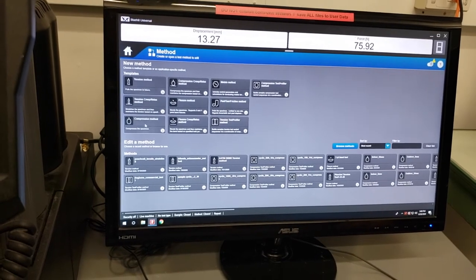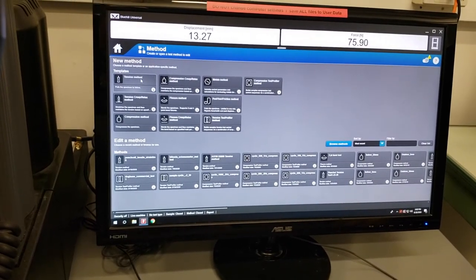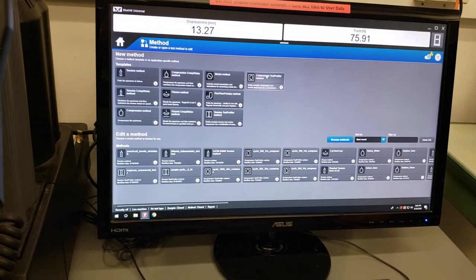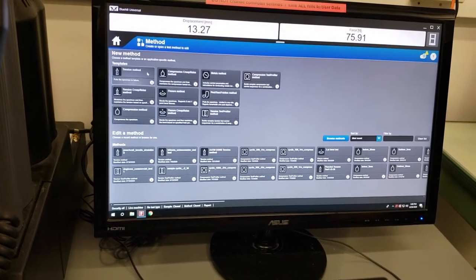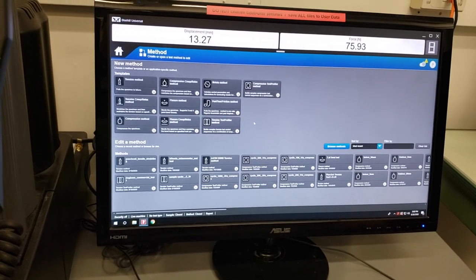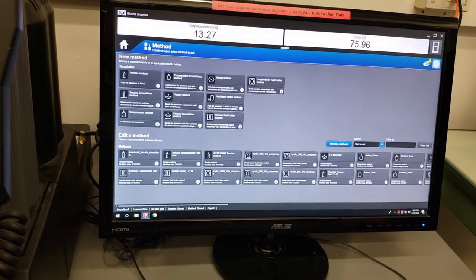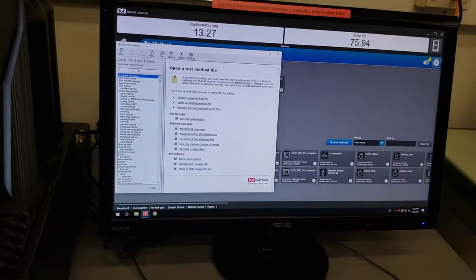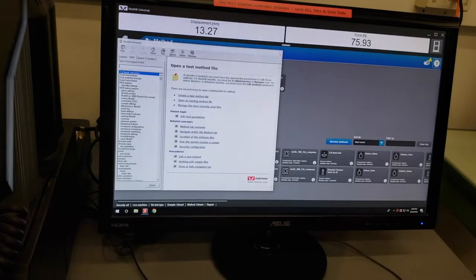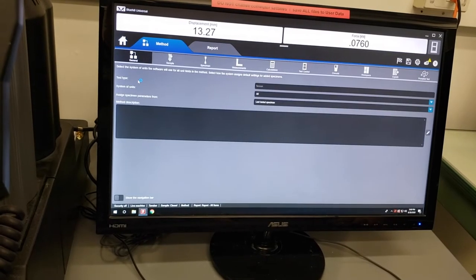Since our most common methods are tension and compression, I'm going to work within a tension method — also because I am using grips that are only used for tension. All of these are fairly easy to figure out, and a lot of the principles I go over in the tension method will apply to the others. The help options in this software are really stellar. If at any point you have questions, click the question mark button in the top right corner — it'll give you information about the page you're currently on and you can type keywords to search the help menu. I'm going to open up a default tension method and go through start to finish creating it.